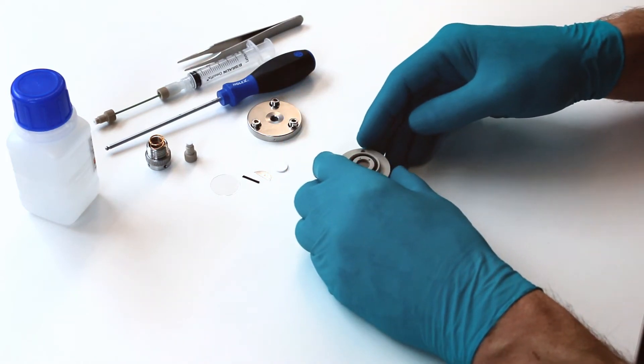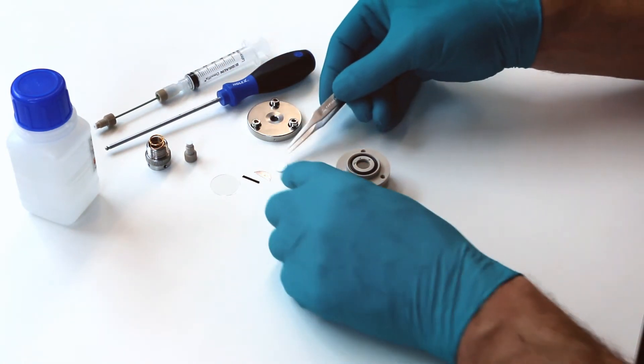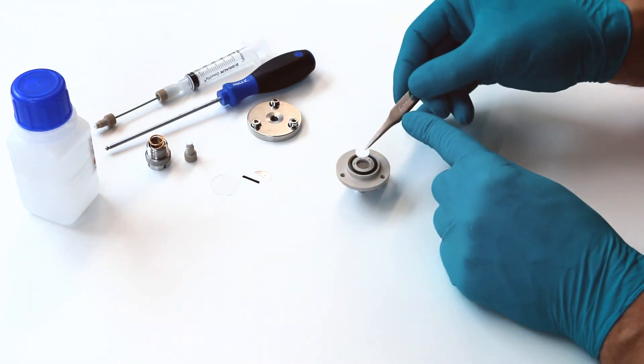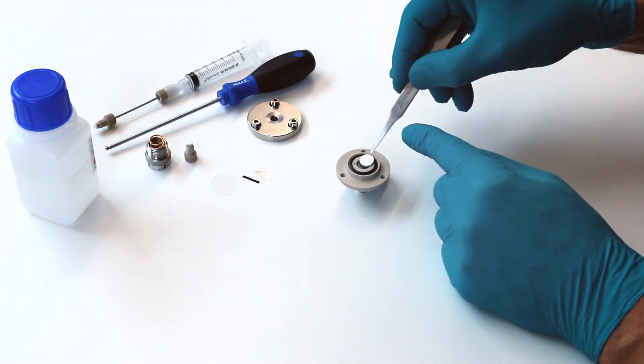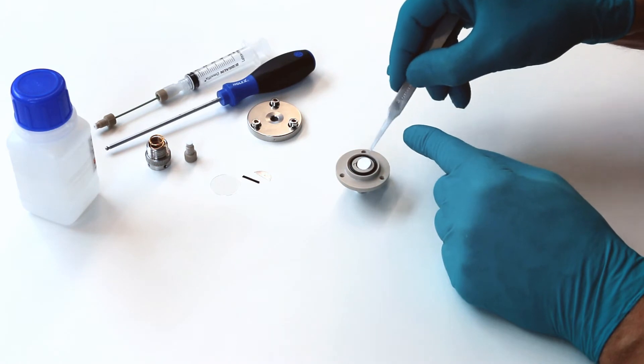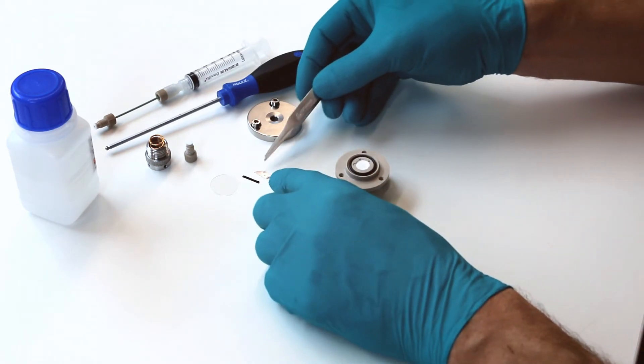Put the assembly onto the desktop. Insert this glass fiber separator, which is 1 mm thick and 10 mm in diameter.